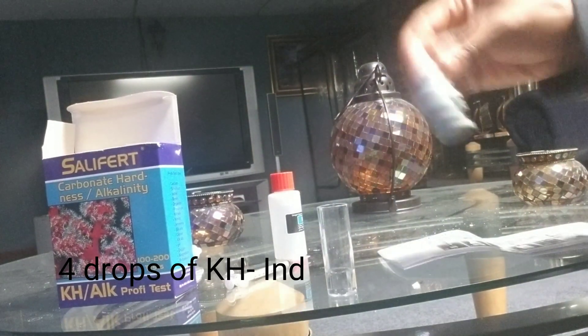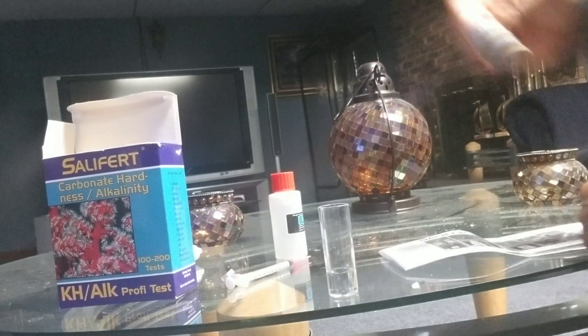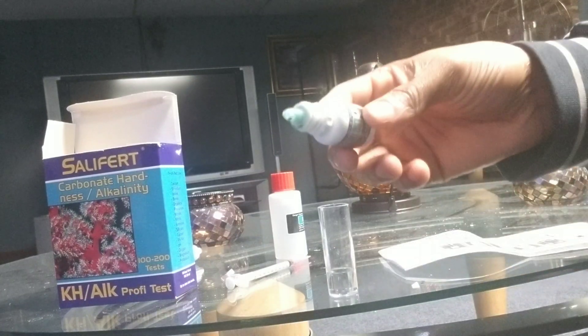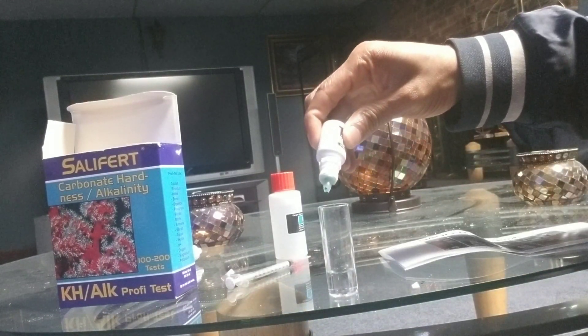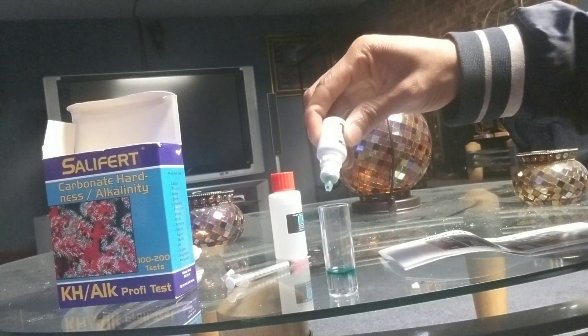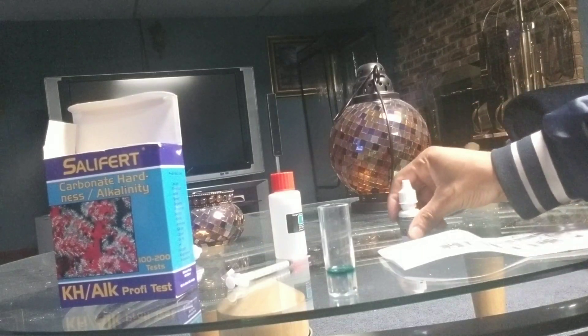Next, you need four drops of the KH IND bottle. An important step is to shake it before you add the four drops. So one, two, three, four. Finish with that and place it back into the box.